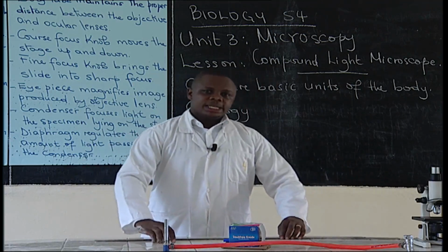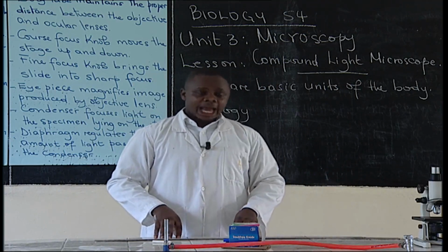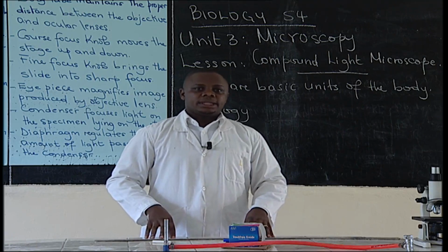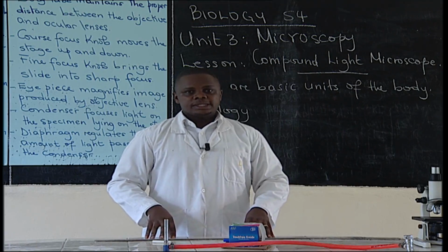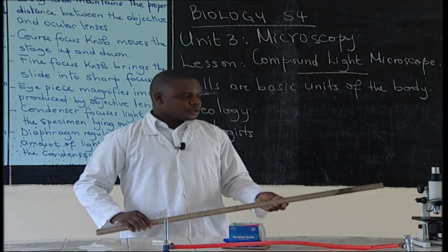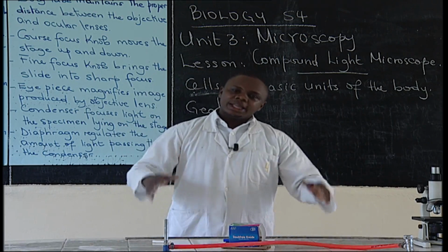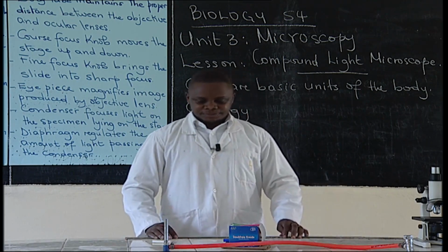So as we can see, microscopes are very important in everyday life. And there are very many institutions where they are used. We have seen schools, universities, hospitals, forensic labs, and geologists also need them. You can also find or think about other places or institutions which need microscopes.